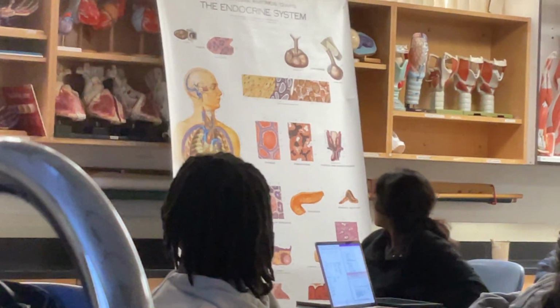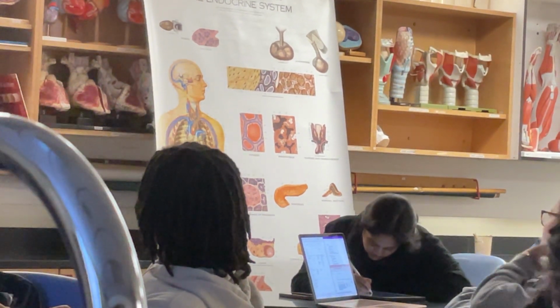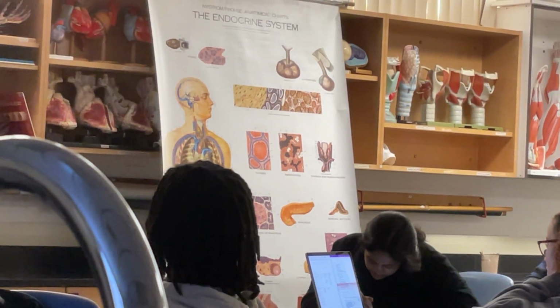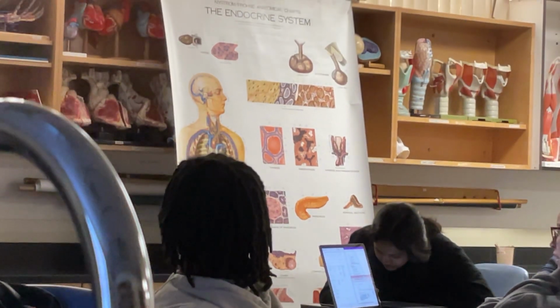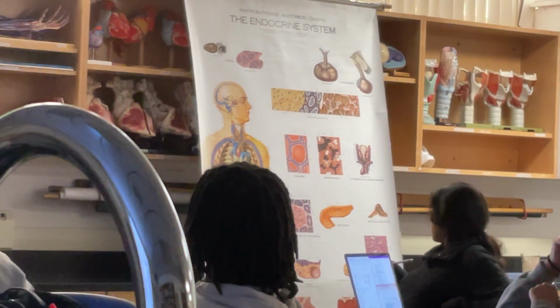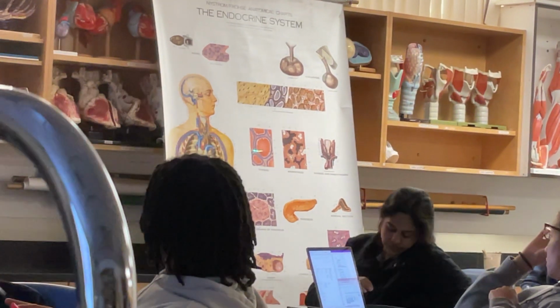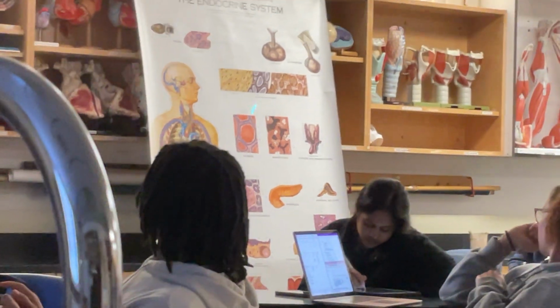And from everything we know about the oxyphils, guess what the big dark cells represent? Nope, they're the oxyphils. I don't know why they chose to make the oxyphils dark on that illustration. It is incredibly stupid. But the good news is the dark cells are clearly larger. So they are clearly larger. That's how they're labeled in the chart. So the larger ones are the oxyphils. So even though they made them dark, we'll stick with what they said.